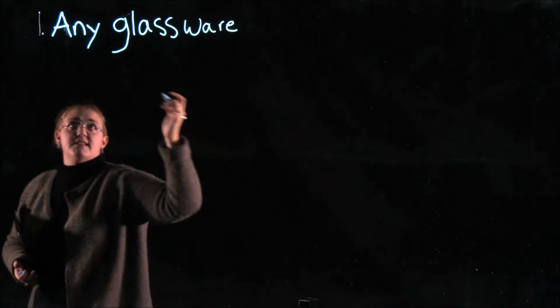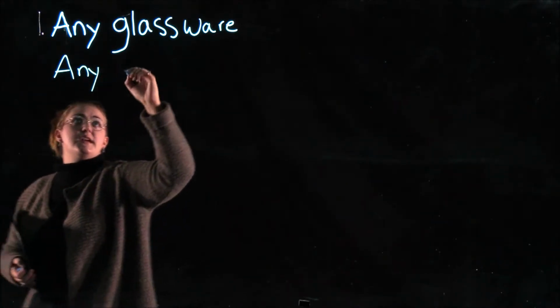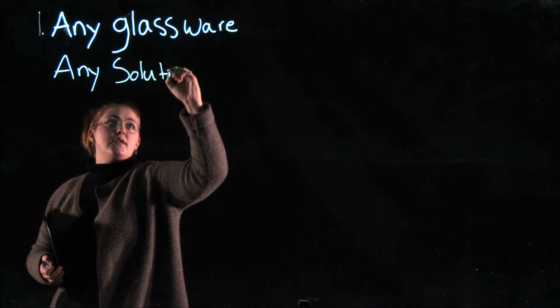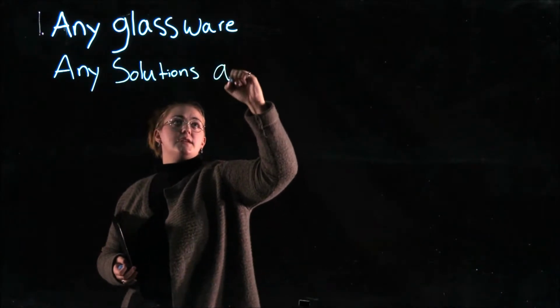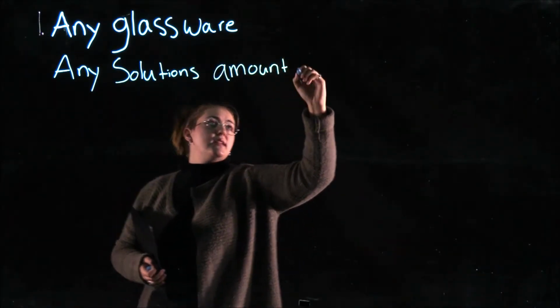And since this is a buffers lab, you also want to include any solutions you're using, remembering to include the amount with units.